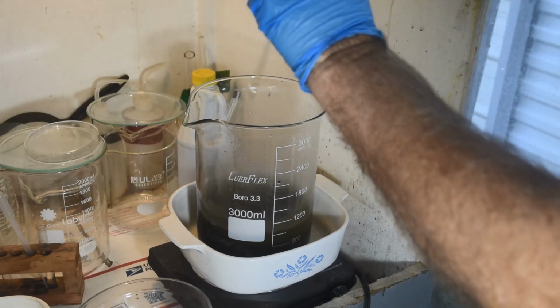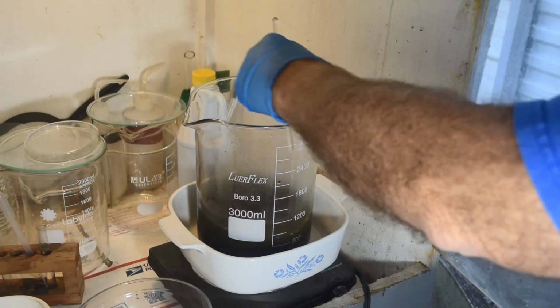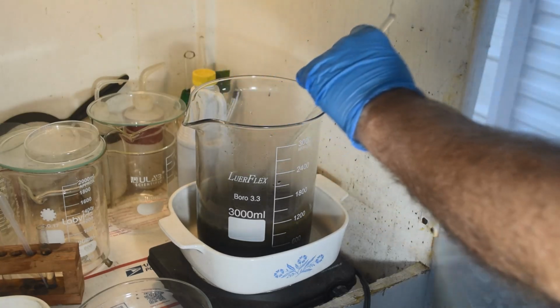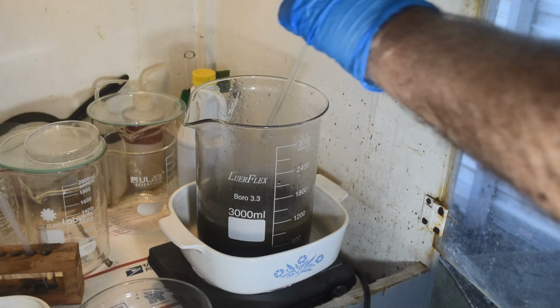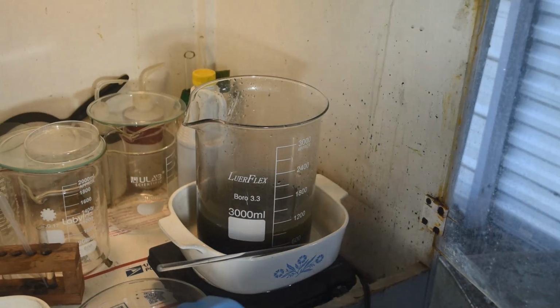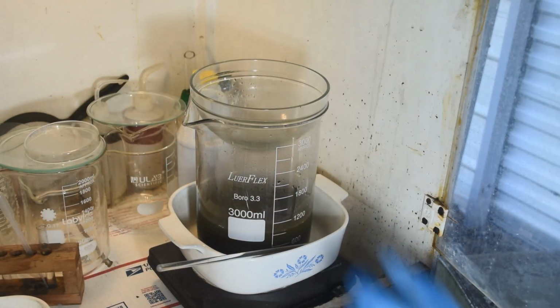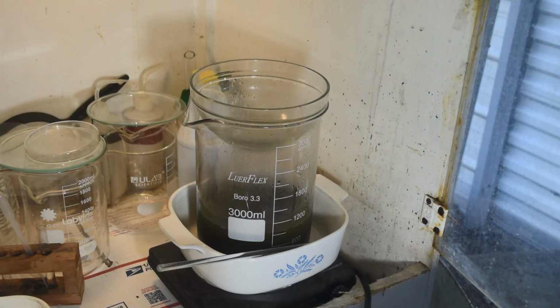A good stir here. Get it all distributed. Okay. All right, so let me put a lid on it, keep the heat in and reflux it a little bit, put some heat to it. I don't want to boil it too hard, but I know that heat's going to help because it's really cold out here. It's winter, even in Florida it's cold. So we'll get this going and see how long it takes.